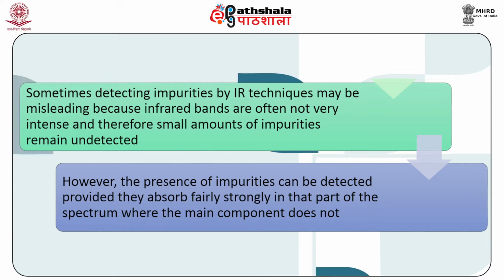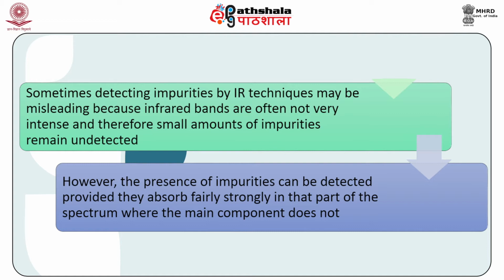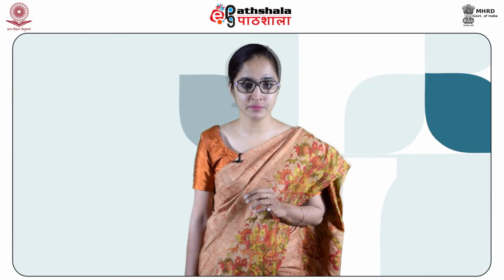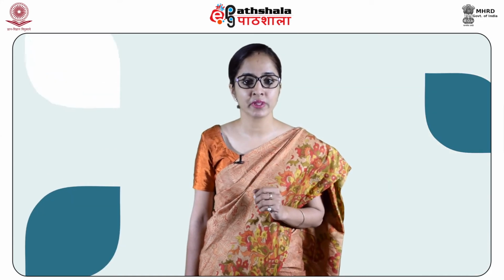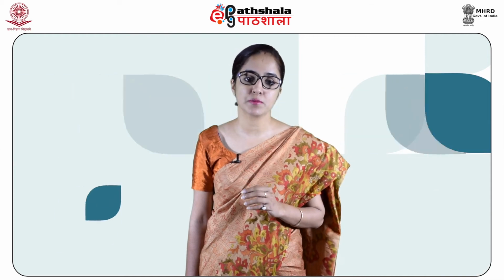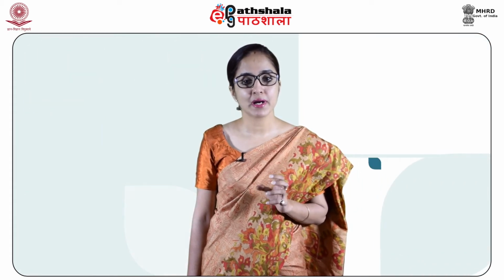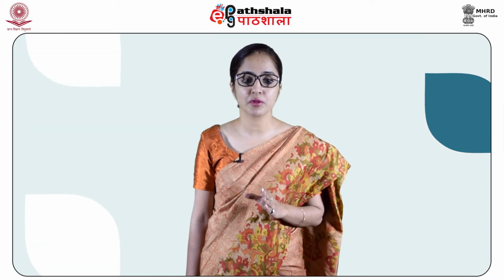The presence of impurities can be detected provided they absorb fairly strongly in that part of the spectrum where the main component does not. For example, the presence of cyclohexanone is readily detected as an impurity in cyclohexanol on account of its intense carbonyl absorption band. The difference method is sometimes useful in recording the actual spectrum of the impurities by placing the impure sample in the sample beam and the same thickness of the pure compound in the reference beam.